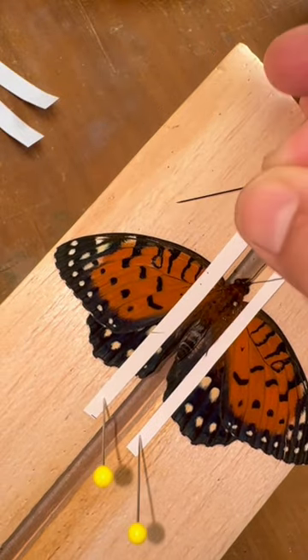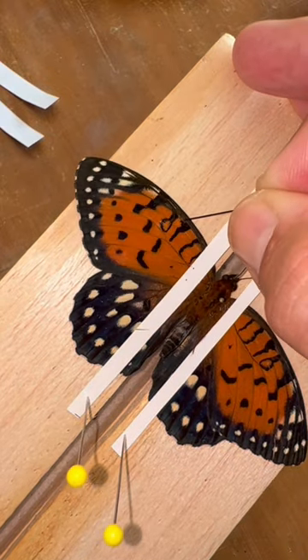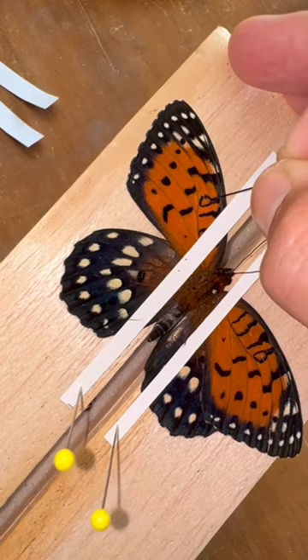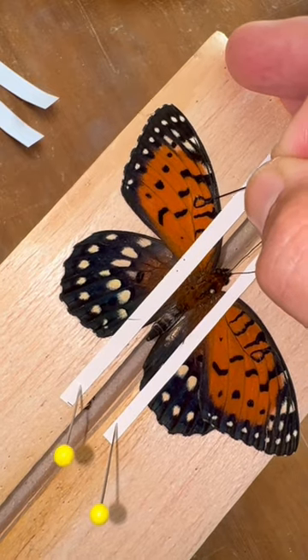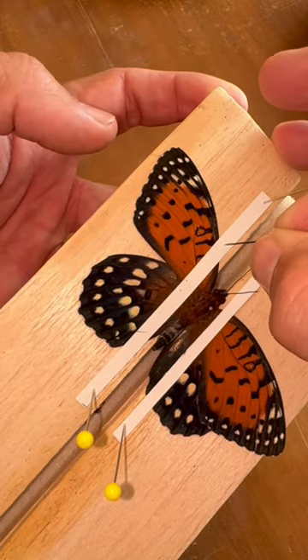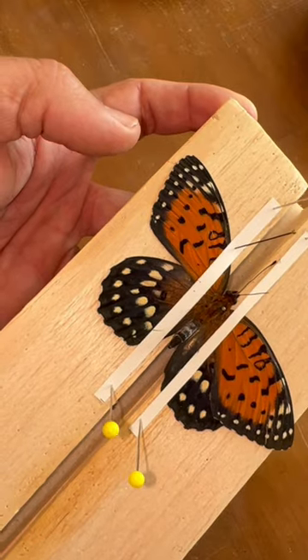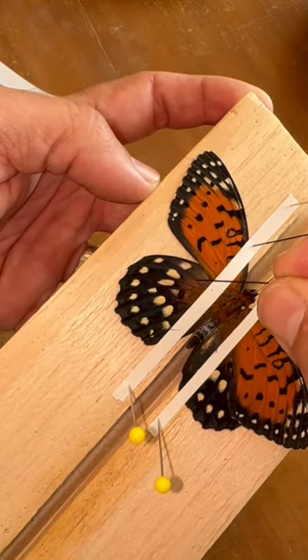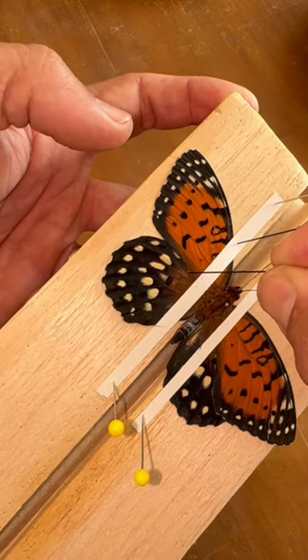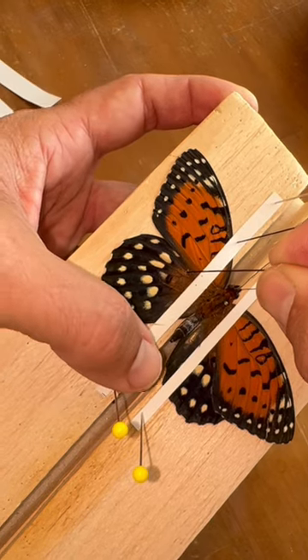I'll just slide the wing up into position using the vein — I'm not puncturing the wing, just using the vein of the butterfly wing to move it into position. Then I'll pin it down right on top of that wing. Same thing with the hind wing. There's a vein right here; I'm not puncturing the wing, just pushing the wing with the vein to get it into position.